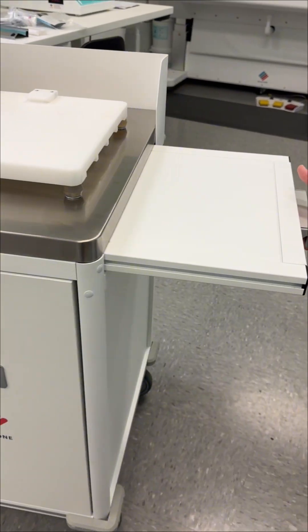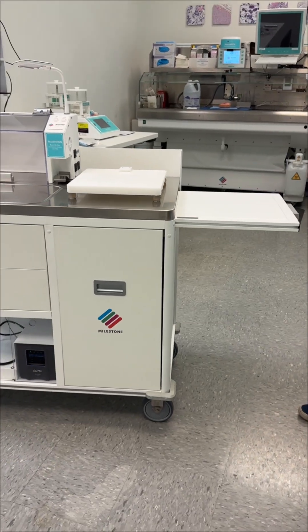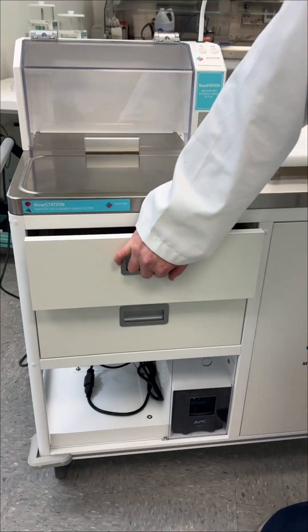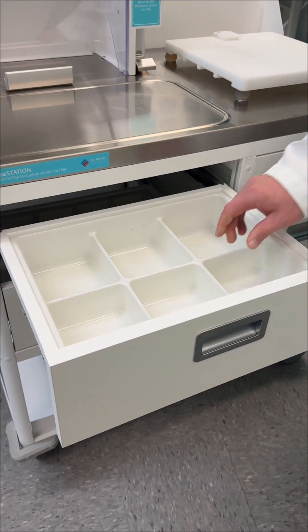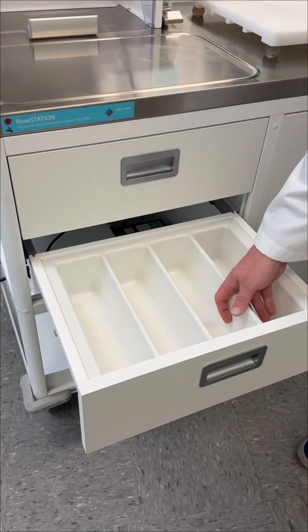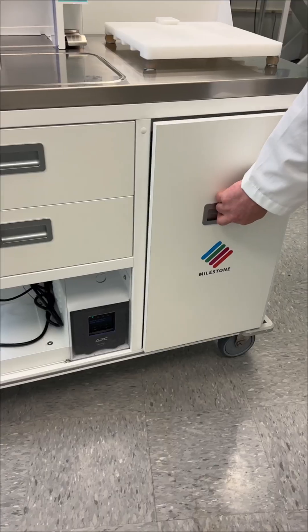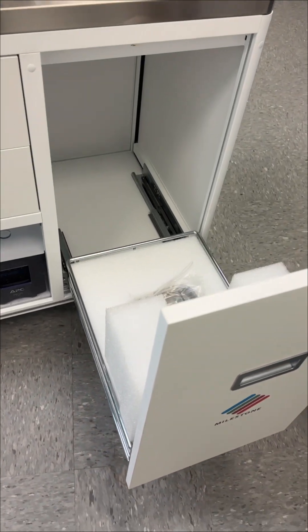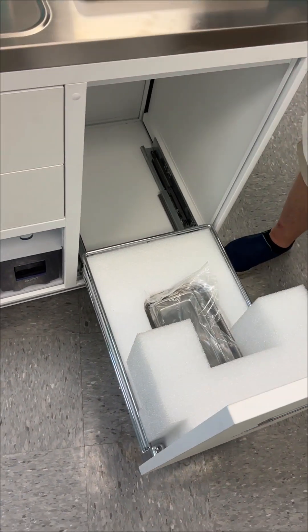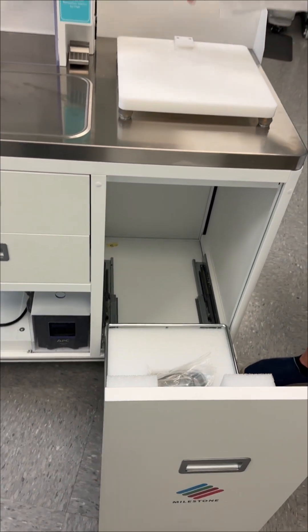To the right, there's a pull-out shelf. This can be used for a laptop or any other supplies you need on hand. The Rose Station also offers ample storage. There's one main drawer along with two additional drawers that include removable dividers. These dividers can be taken out if you prefer an open space. Below, there's a larger drawer designed specifically for storing the microscope when it's not being used on top of the unit. Most users leave their microscope in place, but this storage option is available.